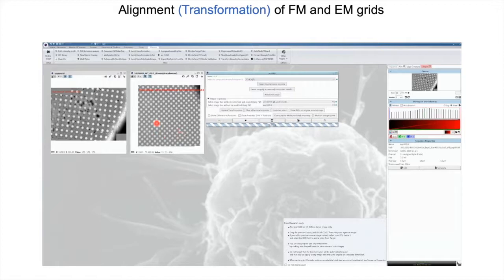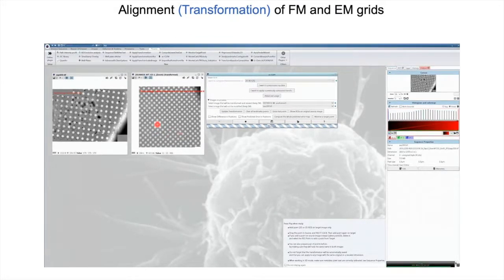So you need to have your EM images on proper scale. You need to have the information of the pixel sizes of your EM image, and then you need to have the pixel sizes of your fluorescence image. This is what you get from the metadata, right? So you put it in the CLEM software. There are basically 2 selections over here. One, you say it's a fluorescence image you put there, an electron microscopy image you put here, and then you start by pressing play, right? So once you press play, you come to something like this.